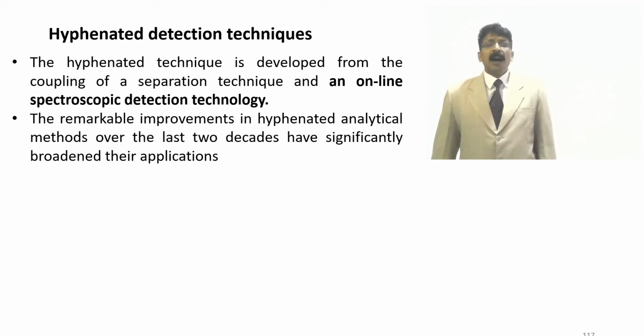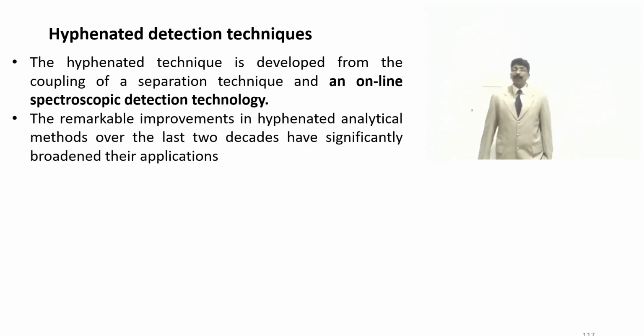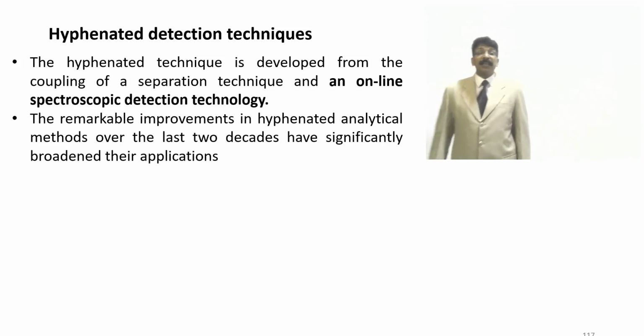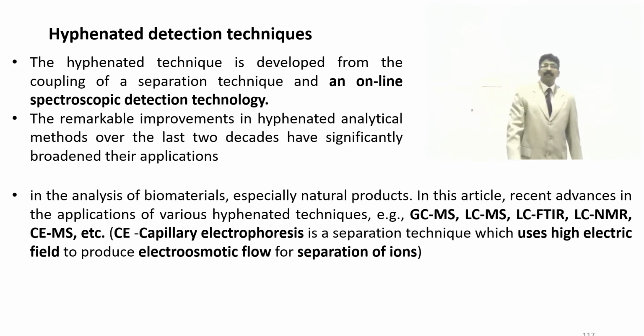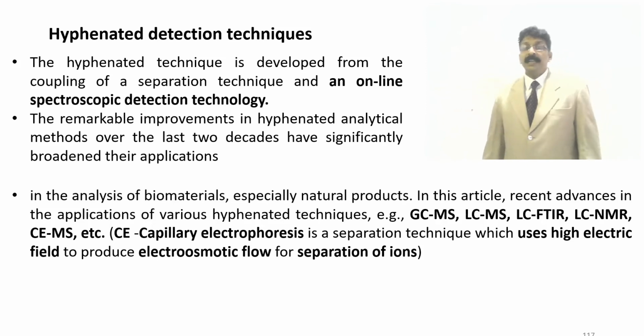The remarkable improvements in hyphenated analytical methods, you have to remember this word, over the last two decades have significantly broadened their applications in the analysis of biomaterials, especially natural products.